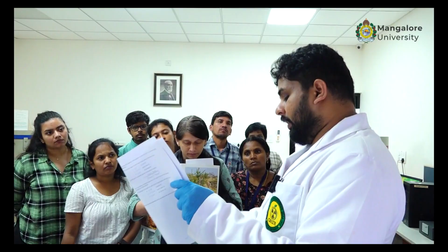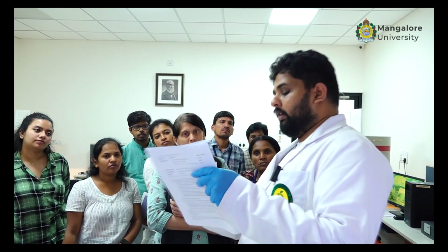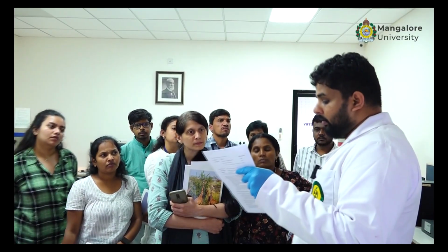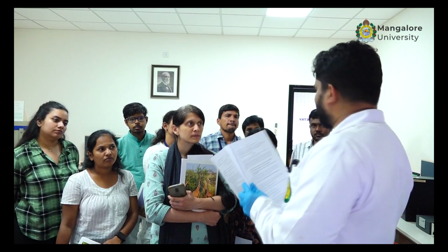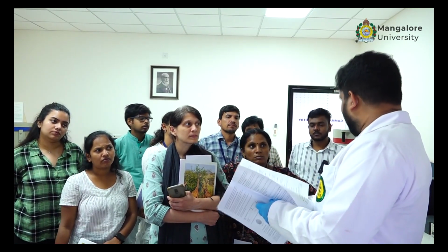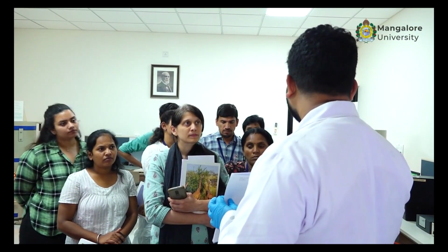How they evaluated, and if it is A, it means accepted. Trueness and precision is accepted. N means not accepted. W means trueness is accepted but precision is not accepted, so it would be a warning, so you have to correct. So we have got almost all as accepted, so not most, I think all. So that's how we can say that our results are standard.